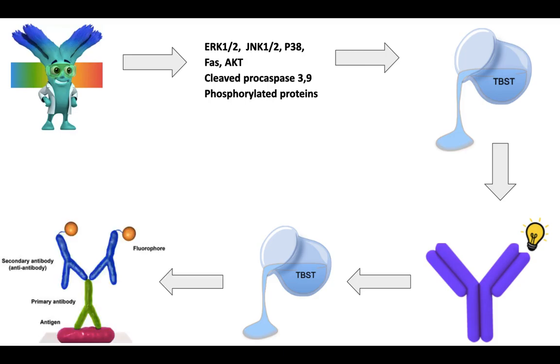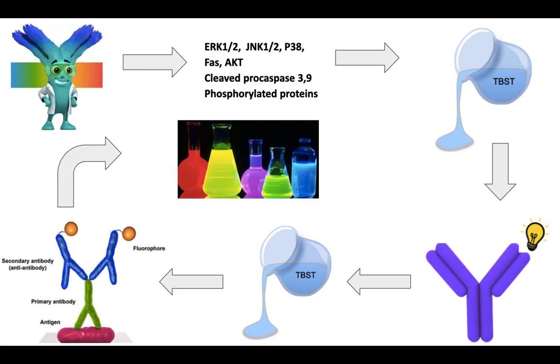Following this, we can then identify based on the secondary antibody if fluorescence is present, such that it will fluoresce or it will light up based on the fluorescence or the imaging technique that was present on the secondary antibody. It is important to note the primary and secondary antibodies need to come from different animals to ensure that the secondary one will bind to the primary one in an accurate manner to show its presence.